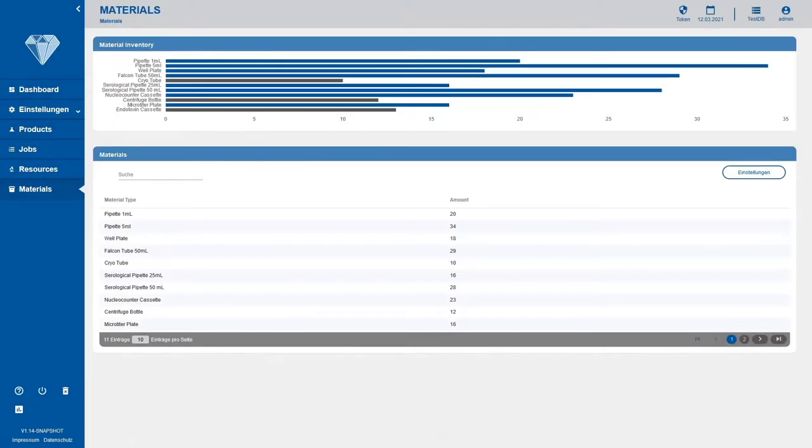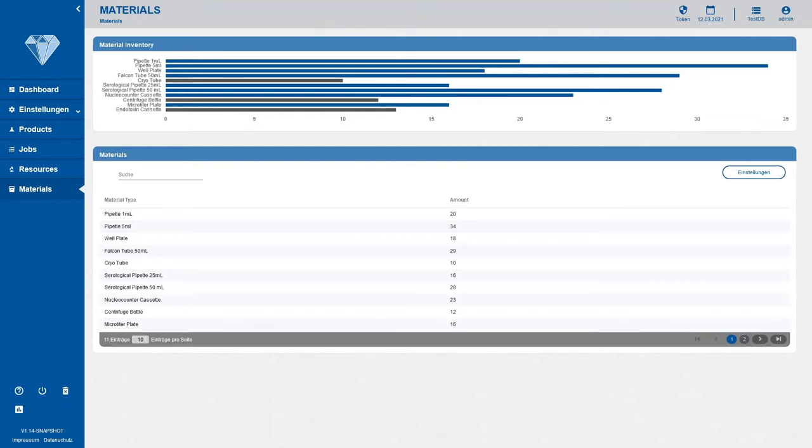Lastly, there is the materials overview page, which shows the stock of each material in form of a bar chart. When a material falls below the threshold, the bar turns grey, indicating that the stock is low. In addition to the bar chart, there is also a complete list of all materials with the amount of the material in the system.